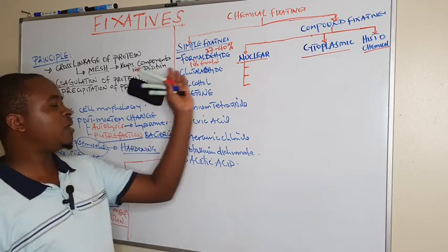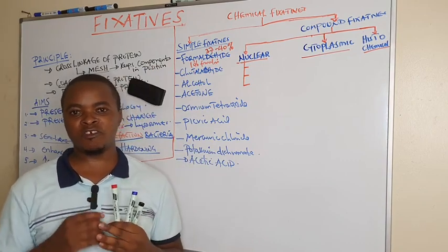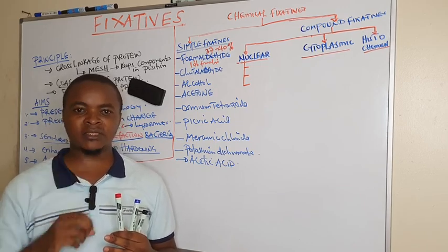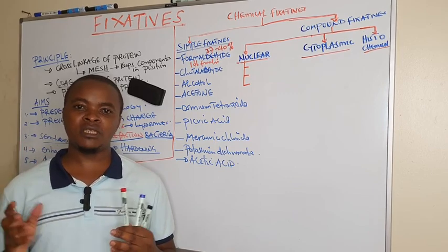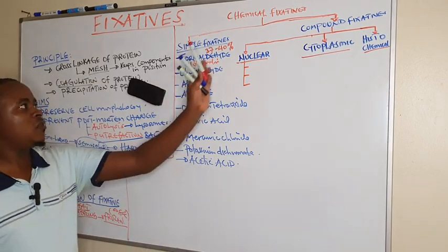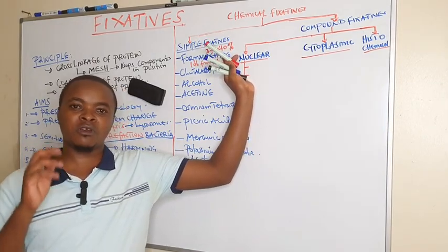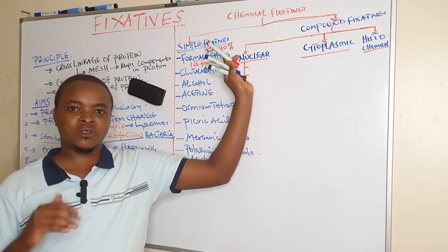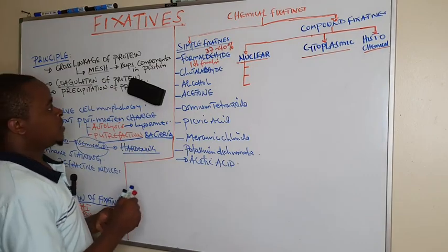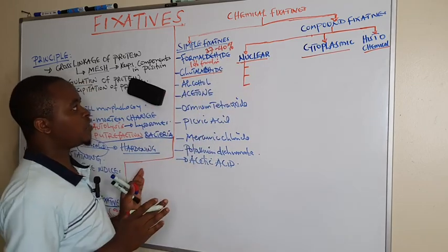When formalin is stored in a cold place, it can lead to the formation of paraformaldehyde, which is seen as white precipitates within the formalin. Whenever they form, we can easily remove them by filtering. Another thing is, when it has stayed long, 10% formalin can form yellow pigments, what we call formalin pigments, which can affect staining when present. Glutaraldehyde also acts by cross-linkage.